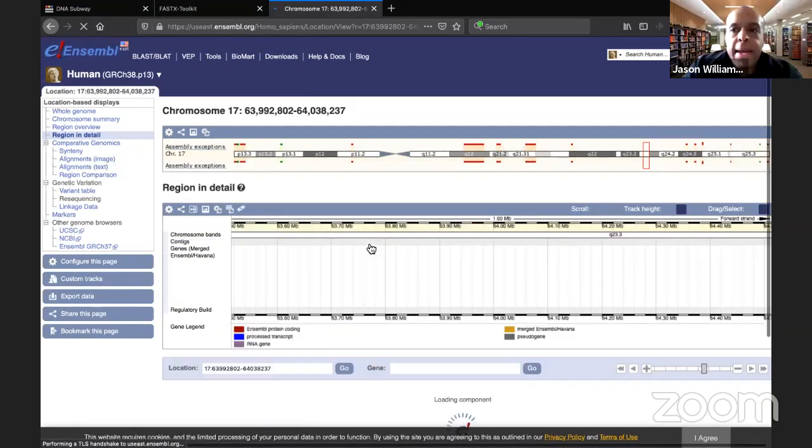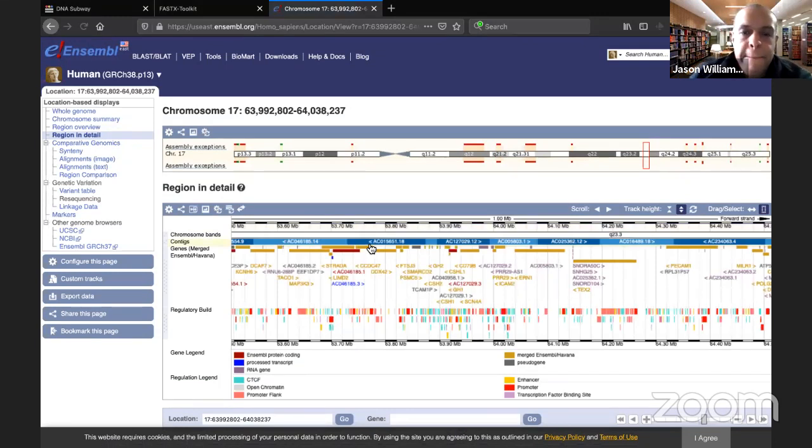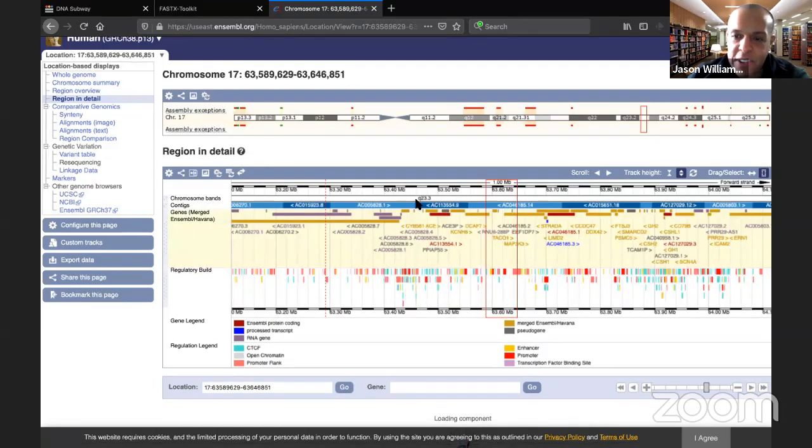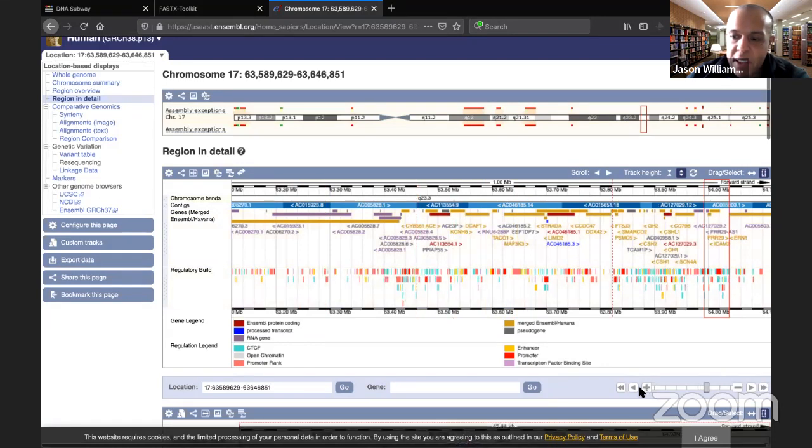And it looks like I am on chromosome 17. On chromosome 17, I can see all of these little names. I don't know what that gene is. There's a gene called TACO1. It's almost towards lunch, so let's click on jump to that region. And in fact, if I click on the plus button, let's see if I can zoom in a little bit.